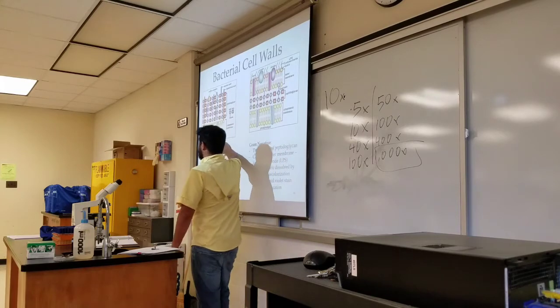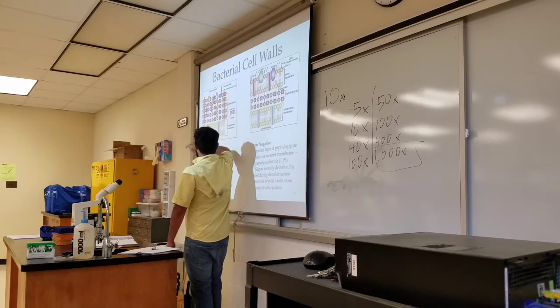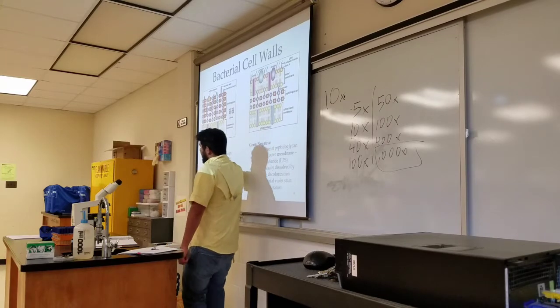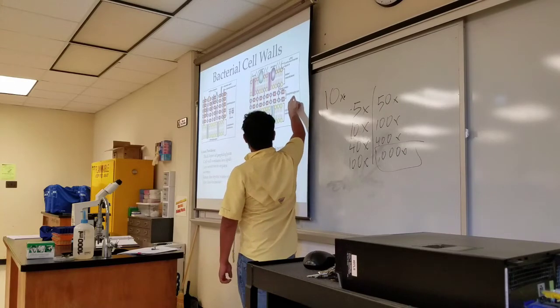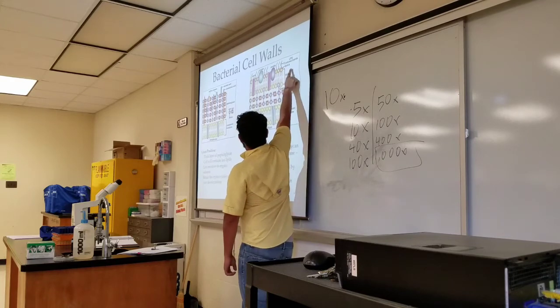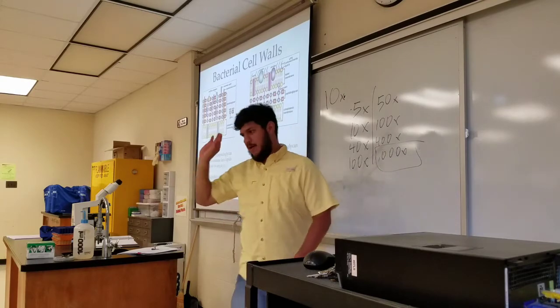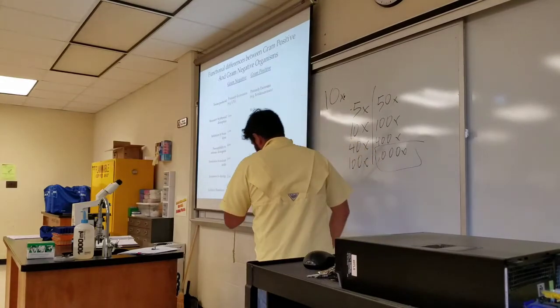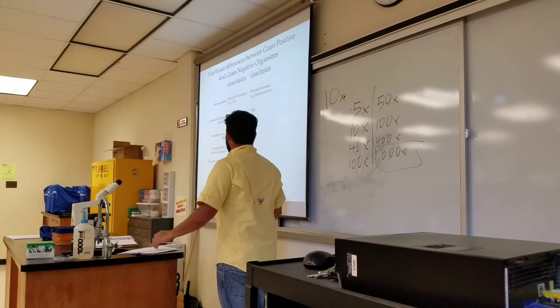For gram positive bacteria, we have a thick cell wall of peptidoglycan with fewer lipids, and for gram negative bacteria, we have a thin cell wall of peptidoglycan and an outer membrane of polysaccharides, which is high in lipids. Now, that's basically the difference, but it also has clinical implications such as resistance to antibiotics, for example.